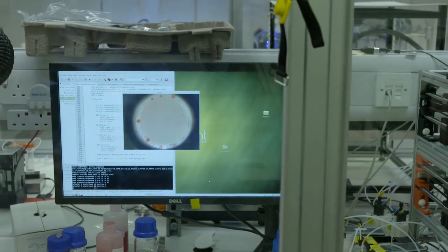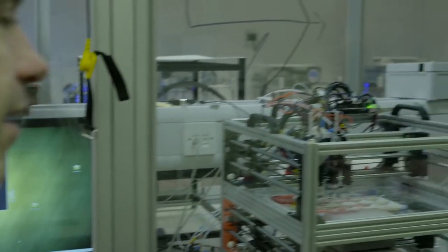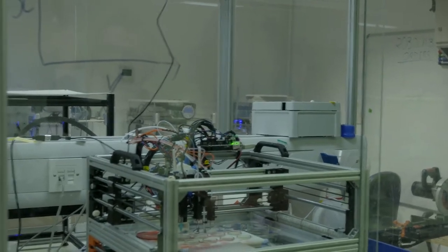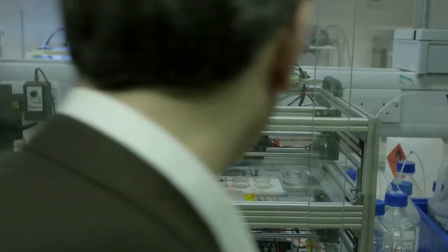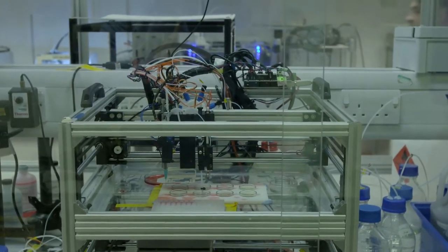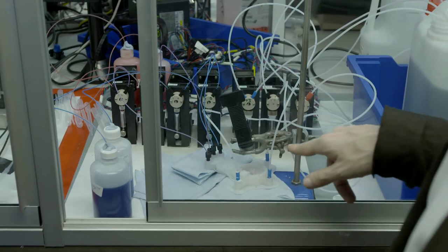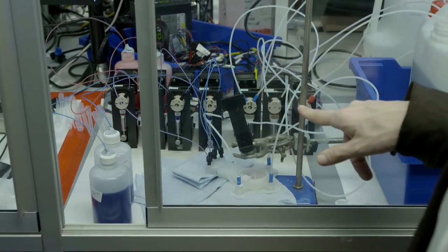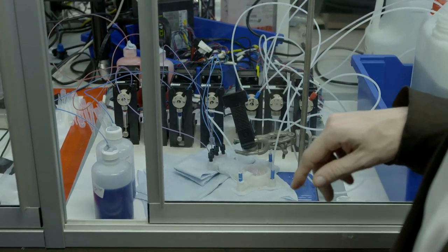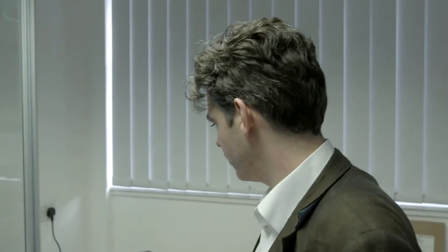Now I see the soap — yeah, it's going through a wash cycle. We have to keep the thing running all the time; at the end of every experiment it washes out and removes the old discarded material automatically. There's no student in this room, it's all automatic. Let's go around and have a look at the other one and see if it's working. This one here is just washing out the dish, and you can see all the pumps moving with the different colors — the reds and the blues — preparing for the next experiment.